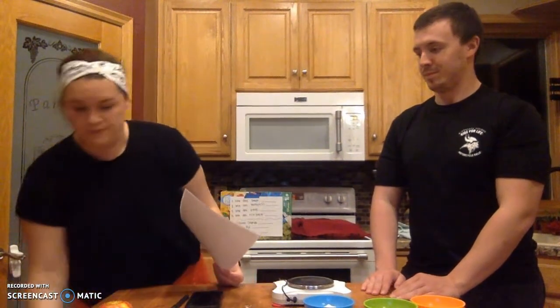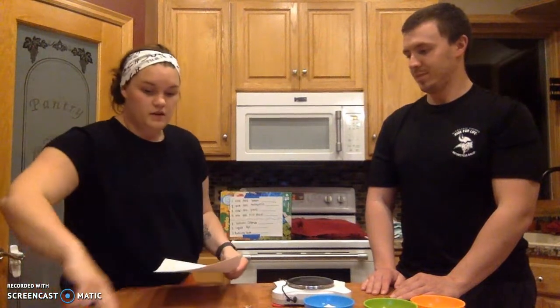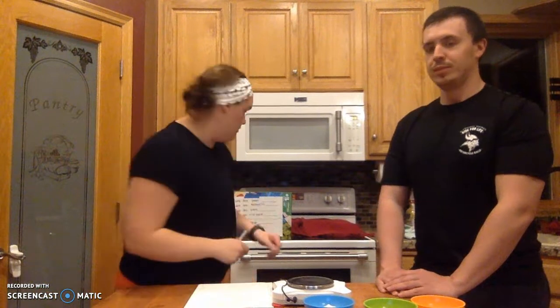Okay, so we're going to do a little demonstration here, okay? And you are going to write down a few things. I'm going to move a couple things here. Get my marker. So we are going to mass out a dozen of a few things, okay?